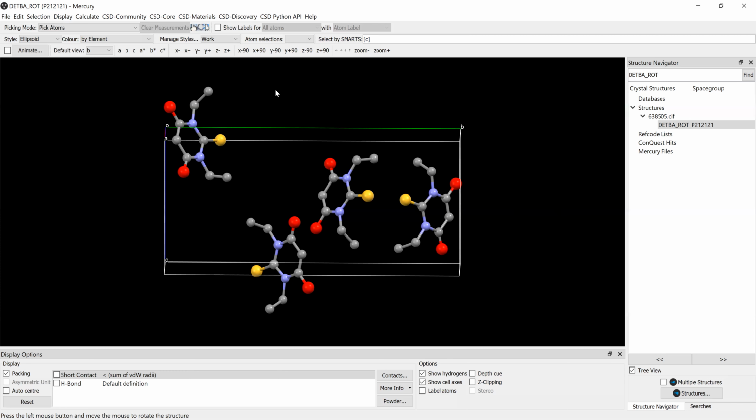So this molecule rotates 180 degrees, which puts it over here, and then shifts down and you form this molecule. Then if you do a screw axis on this, it rotates, shifts up, and that's how we generate all of these molecules in the unit cell by doing what are called symmetry operations. I'll show you in a second how to get these symmetry operations for this space group.